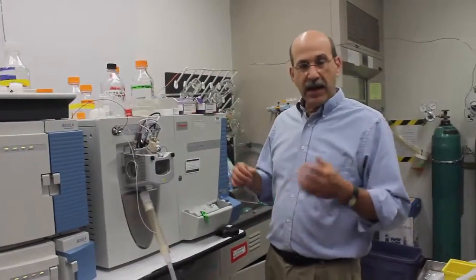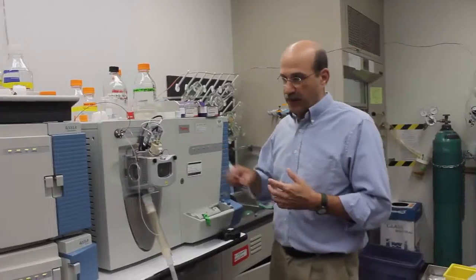So the types of analytes that we would look for by LCMS are generally the metabolites. The active ingredients we might analyze by GCMS: pesticides, PCBs, dioxins, etc. But many of those analytes we would analyze by LCMS, because when the body metabolizes them, it usually makes them non-volatile and more polar. That way we can eliminate them. So if we're going to analyze, and we may analyze in serum, or we may analyze in urine, we would analyze on the LCMS.